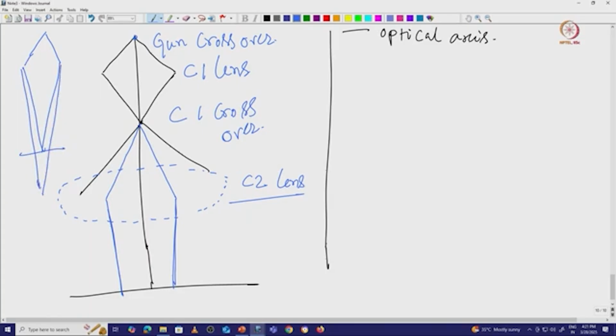So you can see, definitely this lens is under focused condition. So under focused. Now if you just want to measure the angle, this angle is also important, this is the alpha. We can discuss those things at a later stage.